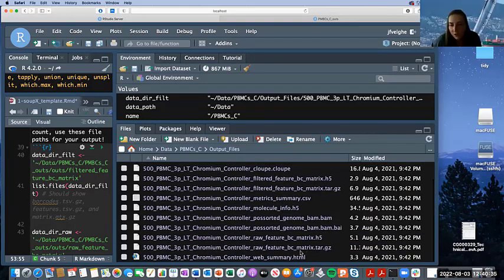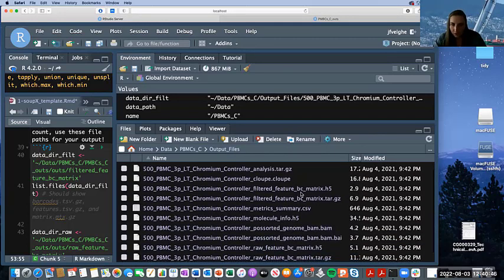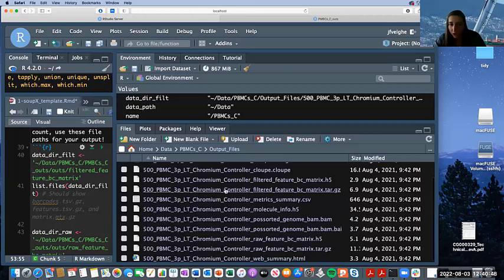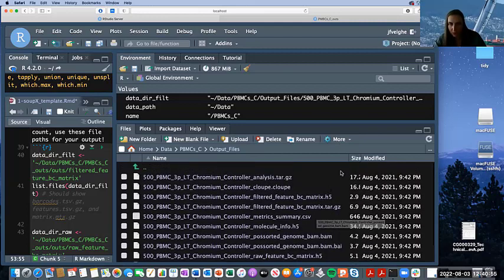Yeah, we can definitely copy those. If you guys want, I can write in how to copy those, or the other option is to unzip these files, but they should be unzipped. Okay, I can write something so you can follow along.